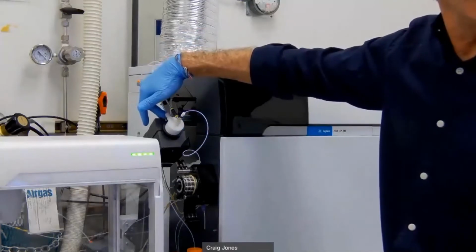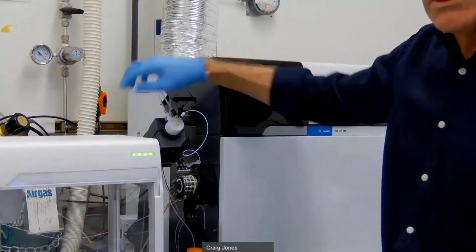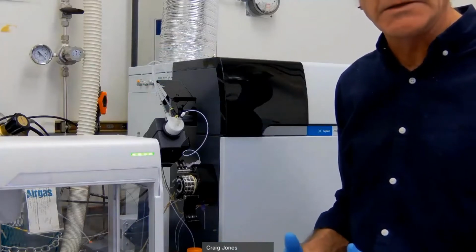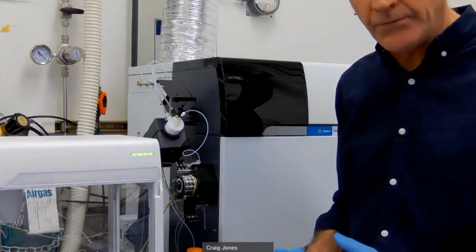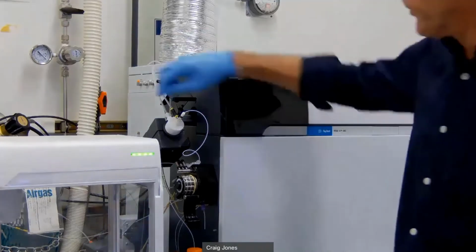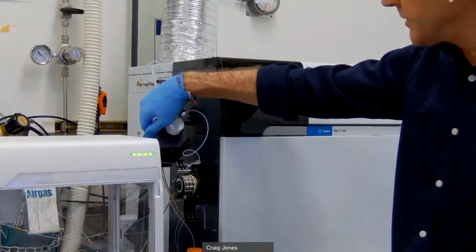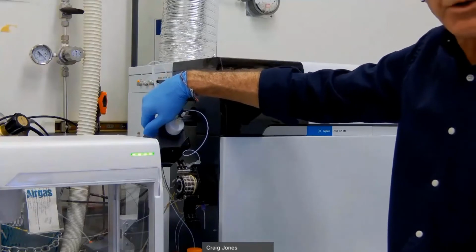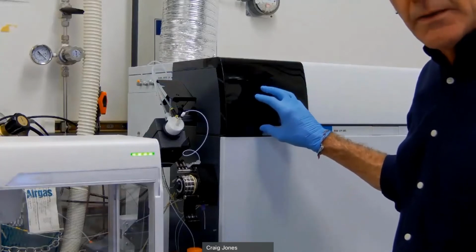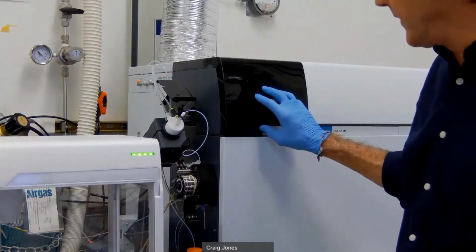Right behind that is where the UHMI is located. I know it's a little bit difficult to see, but that's what creates that aerosol dilution, so we get a very robust plasma. So if we're running high matrix samples, that will help reduce the ionization suppression within the plasma itself, so that we can run up to 25% total dissolved solids. The spray chamber is enclosed in the Peltier device, and we cool that down to 2 degrees for most routine applications, and that helps minimize any large water droplets from getting into the plasma. That creates a much hotter plasma as well. It's important to have a hot plasma. That way those elements such as arsenic and mercury that have very high ionization potentials are ionized more effectively.